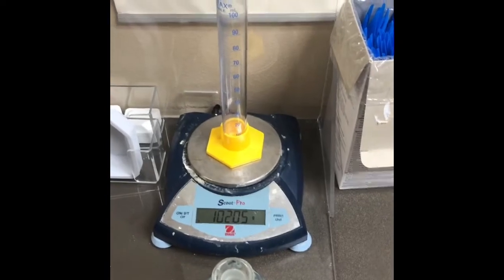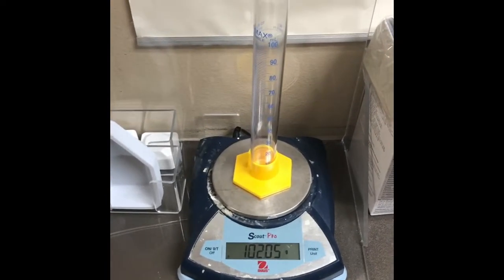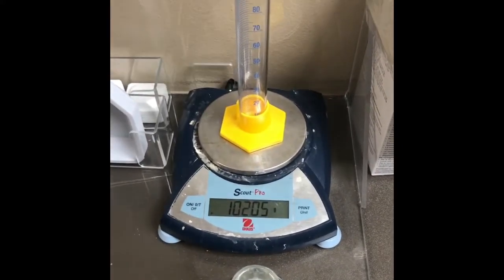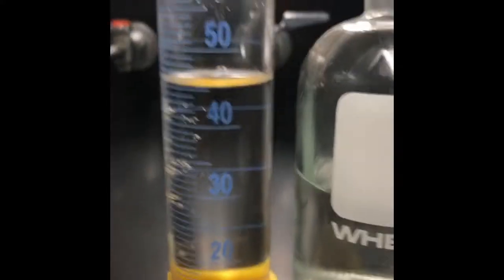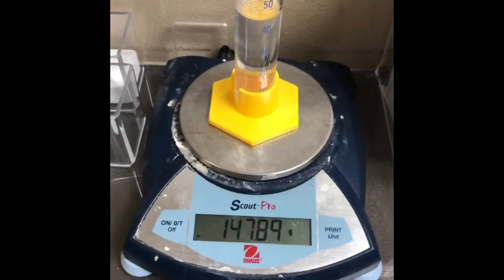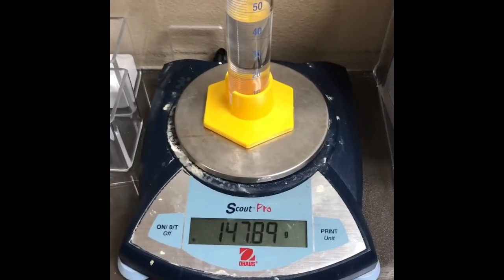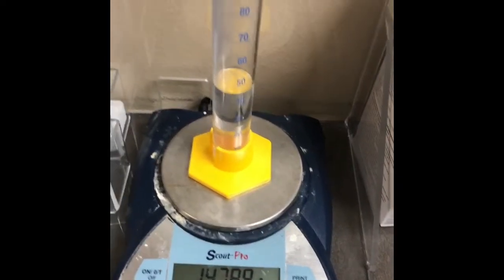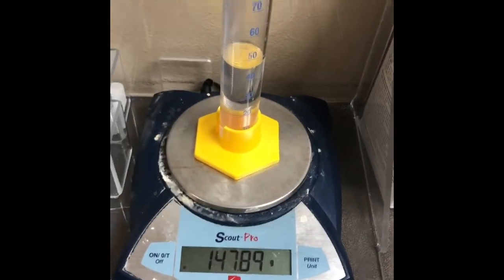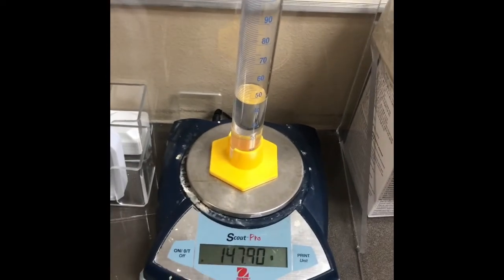The mass of the graduated cylinder we're going to use for unknown number 3 is 102.05 grams. The volume of the liquid is 45 milliliters. I'm going to go back to the scale and weigh it. I get a mass of 147.89. Remember, the way we get the mass of the liquid, we subtract the mass of the graduated cylinder from this mass. To get the density, you do mass divided by volume.